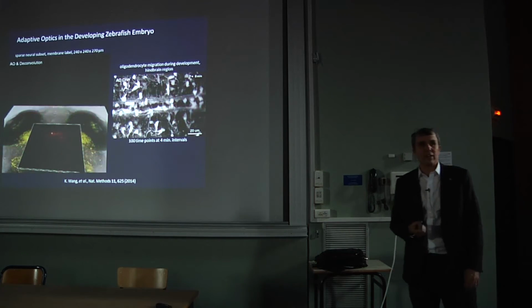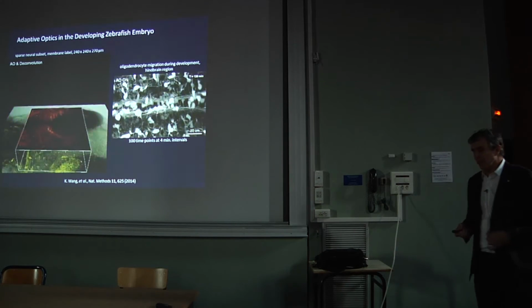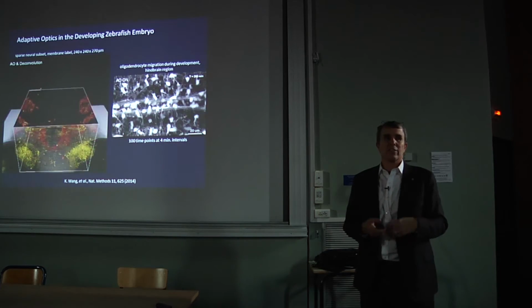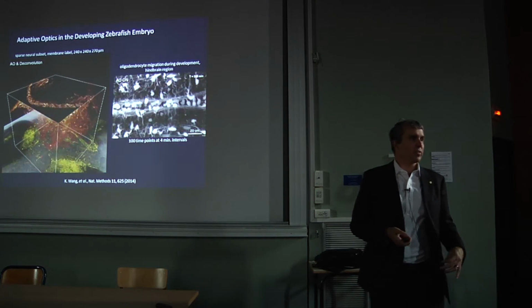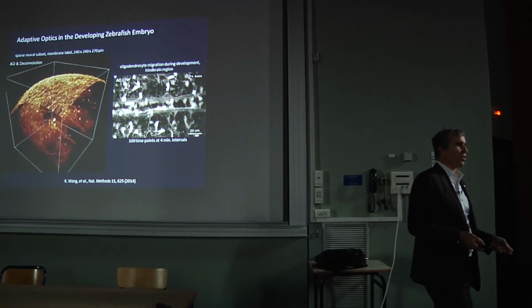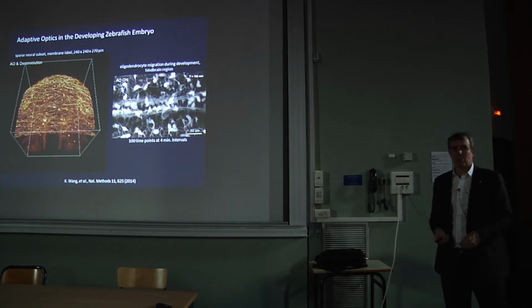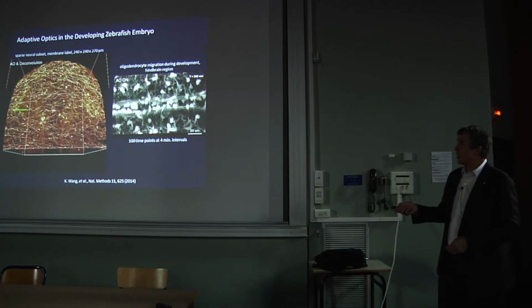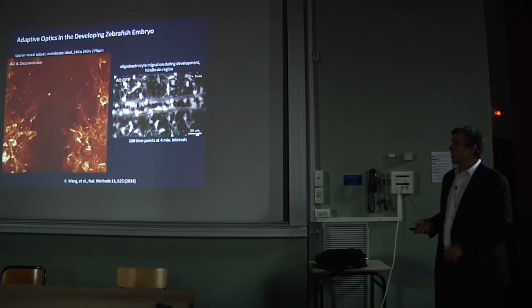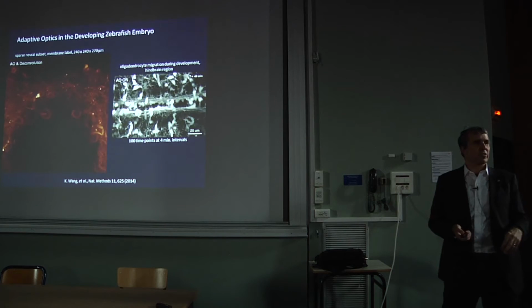So one of the challenges of doing adaptive optics in biology: the challenge in astronomy is that the atmosphere changes so quickly that they need a new AO correction every millisecond. Fortunately, biological specimens don't change anywhere near that fast, but there is the problem that if we want to look over a reasonably large volume, in this case a reasonable fraction of the zebrafish brain, we need to do many, many different corrections because you're going through different material in different areas.